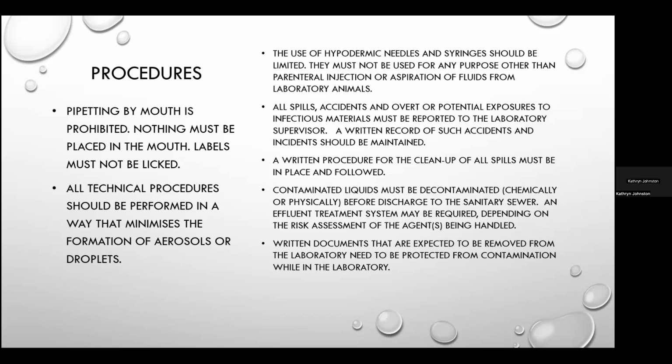It should be that every healthcare worker and every lab worker is familiar with the policy. And they should be posted for easy reference so that in the event of an inadvertent exposure, everybody knows just what to do. All accidents and exposures to potentially infectious materials should be reported to the supervisor immediately, but this should not impede immediate medical attention if necessary.